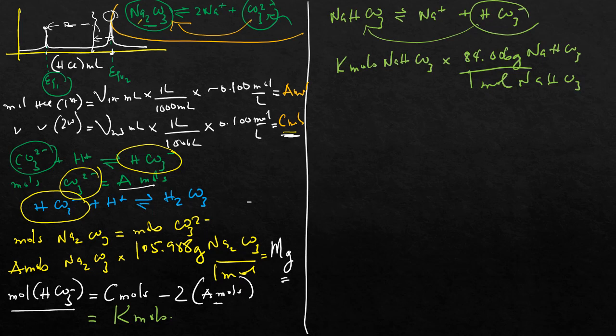So remember the grams you've calculated. Okay, so let's say this gives you n grams. Okay, so you have m grams of the sodium carbonate and n grams of the sodium hydrogen carbonate. Remember, you guys made, I think, a total of 250 and just titrated 25.